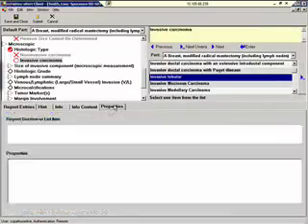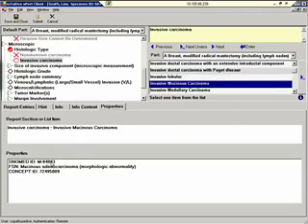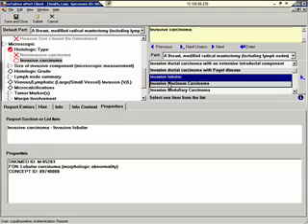Next, let's take a look at the Properties tab. We can capture and assign alternative representations to the structured data. As you can see here, we have SNOMED codes. The SNOMED codes are specific to the piece of data we are working with. You can add additional codes here that are applicable to your specific institution. You can do this using the Agile Author. That's mTuitive's development platform. The Agile Author allows for the creation of custom software applications quickly and easily, without requiring the utilization of software programmers.